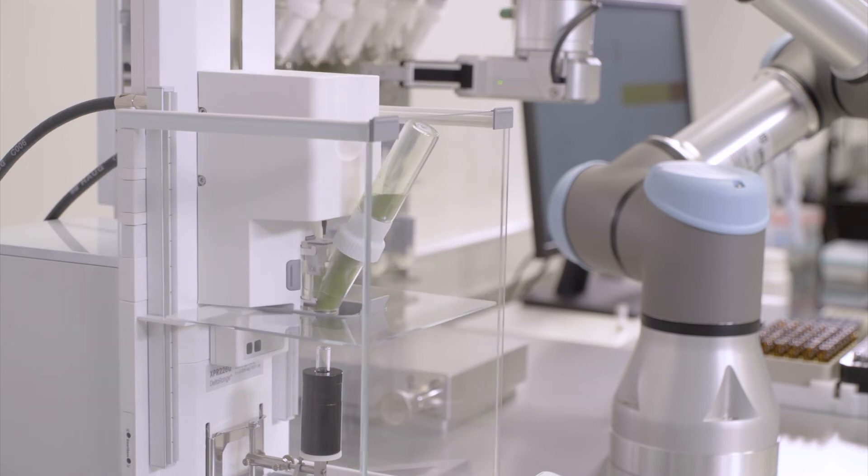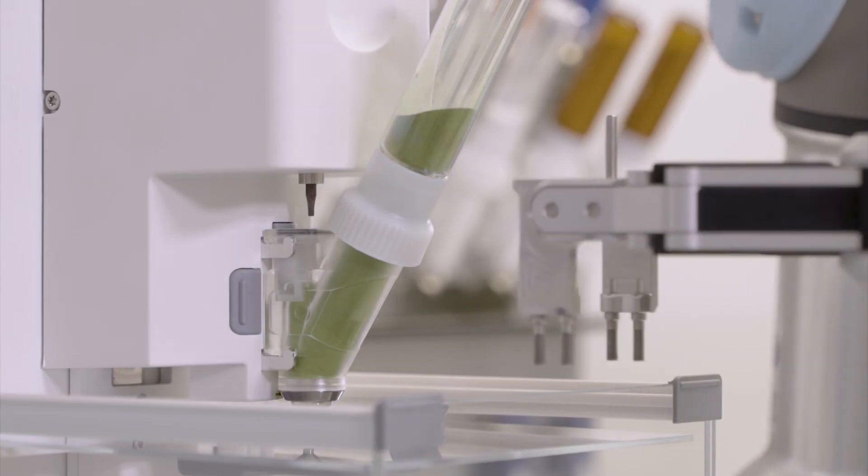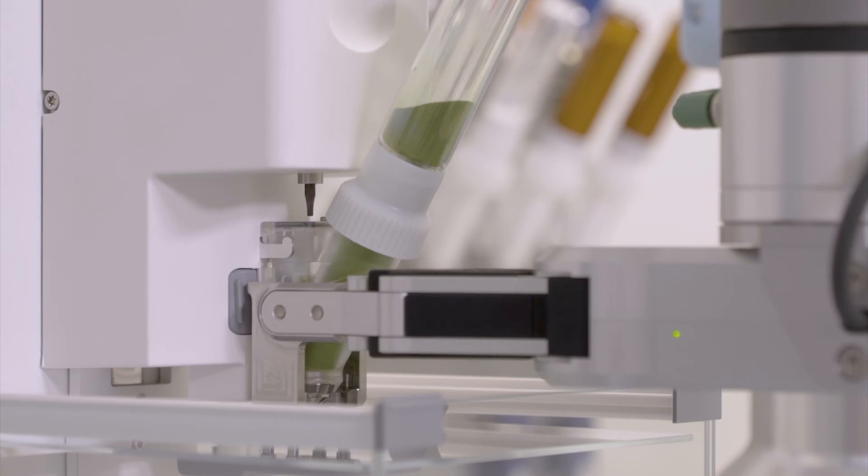Several dispensing configurations are possible: one-to-one, one-to-many, many-to-one, or many-to-many.